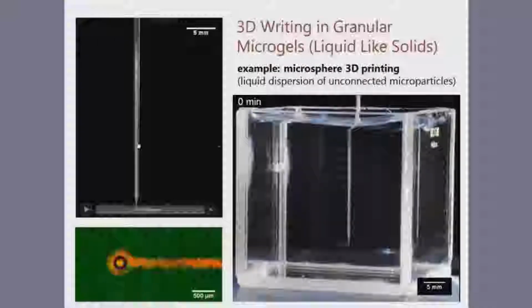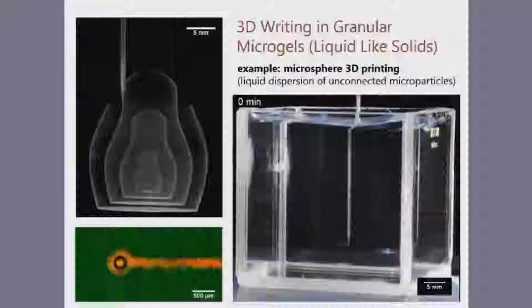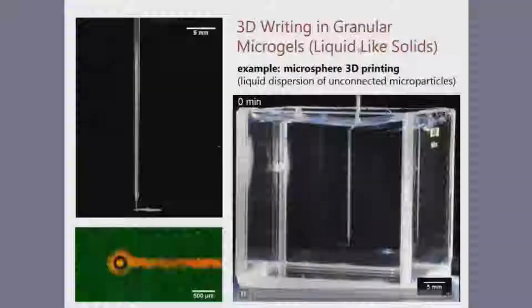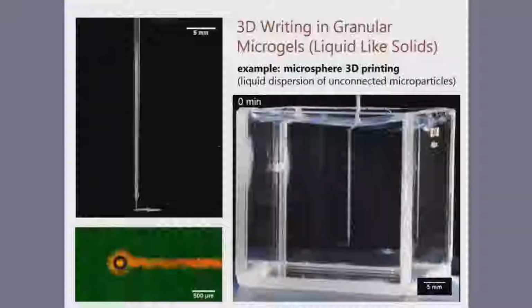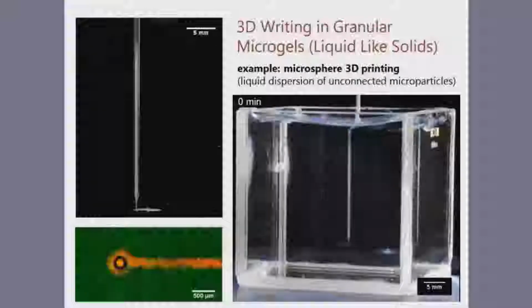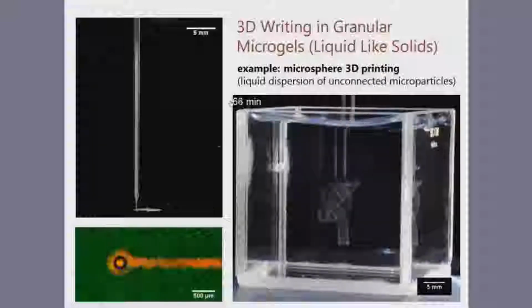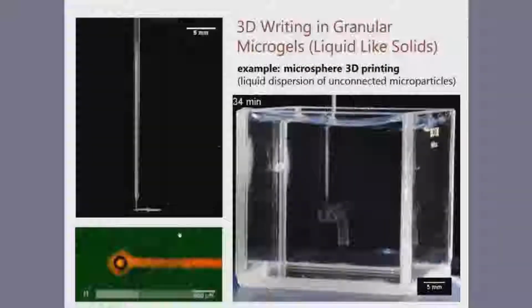This approach allows sharp corners, nested structures, very thin walls, and smooth curves, all to be made out of materials that have no physical integrity themselves. This ability to support structures that can't support themselves is what allows things to be achieved that seem almost impossible, like 3D printing a hollow tube tied in a knot on itself out of nothing but colloidal microspheres that then are trapped in space in this structure. The transparency of this medium allows the details of the printing process to be studied thoroughly by mounting a printing system on the microscope.